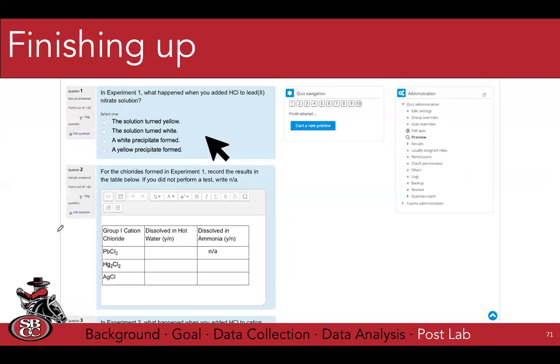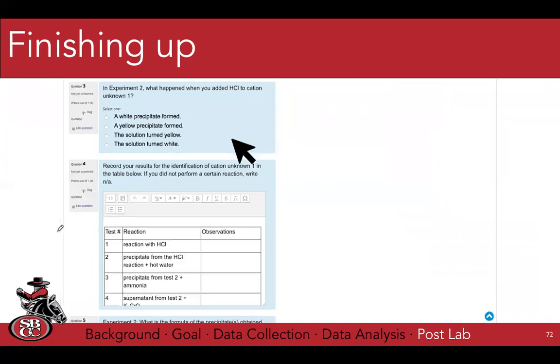So as I was discussing before, here's what the post lab is going to be like. Questions 1 and 2 are the only 2 questions that involve what I have shown you today, that calibration. So a couple things just about those initial steps, but those aren't interesting. You put lead solution in, you know what to expect coming out. So that's not the point of today's lab. Starting in question 3 through 10, these all strictly address whether or not you're able to identify appropriately what is in these unknown solutions.